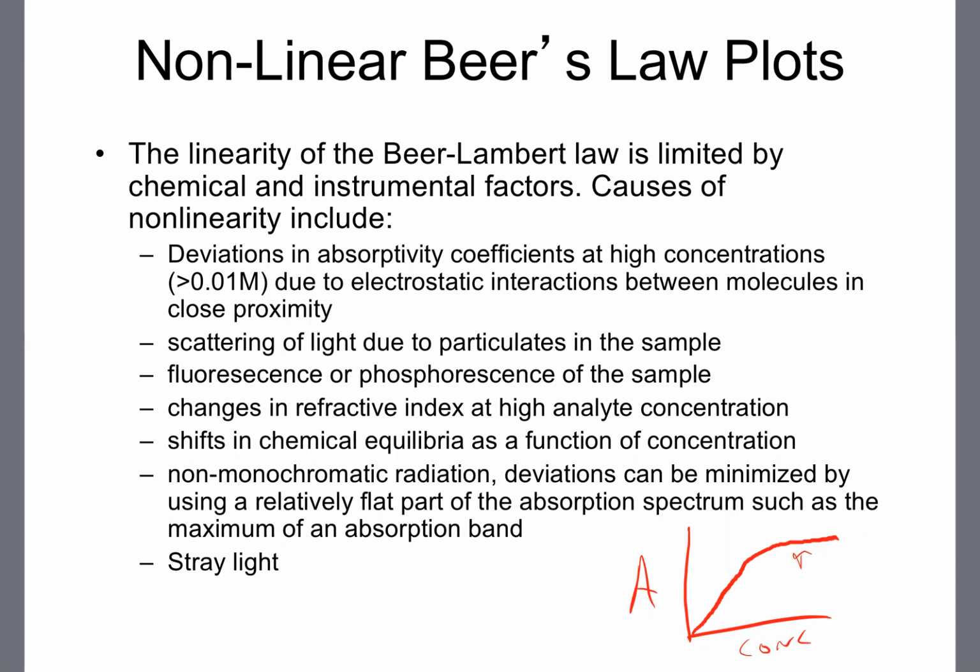So I want you to know that it can happen, first off, and don't be surprised if you see it in your professional dealings. But why does it happen? Or what are some reasons for it, okay? There's actually a number of different reasons, and what's responsible can vary depending on your particular analyte, your particular experimental conditions under study, okay? But these are just some things that can go wrong.